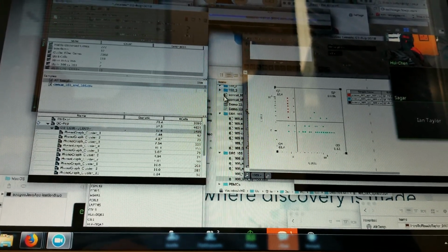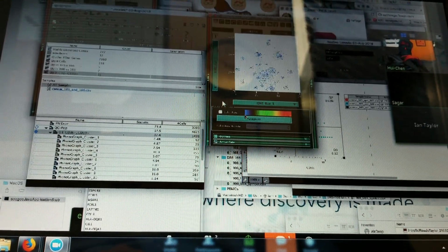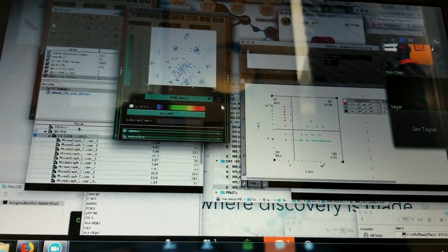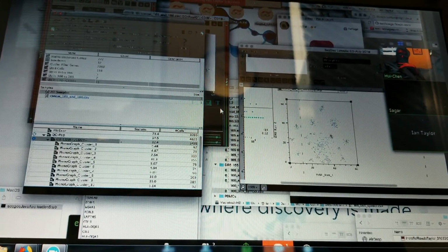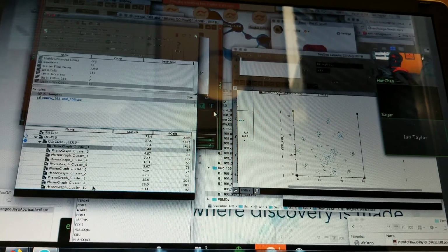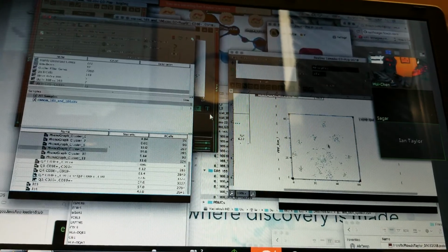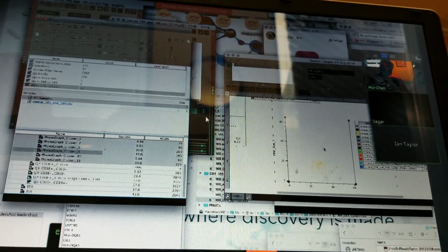It seems like I don't like the computer to work too hard. Yeah, right, I've done this, and then they really get all over the place like this. I noticed that, and I'm sort of surprised that these B cells have so many clusters. But this is exactly where I was, and now I want to know what each cluster is, and what the immunoglobulin expression is in this cluster versus that cluster. You're exactly at the right place here.